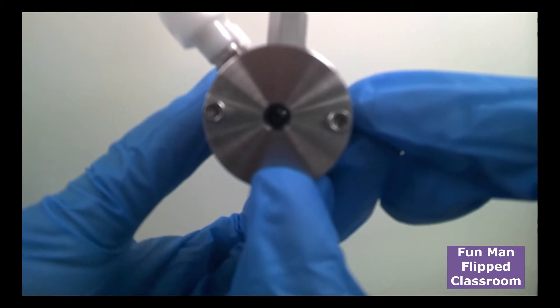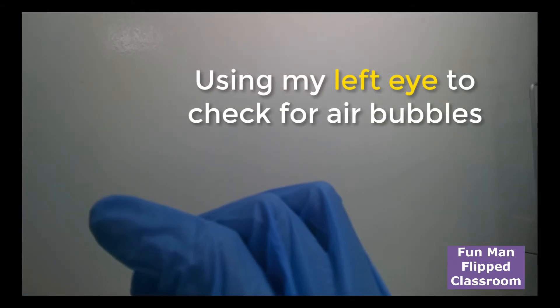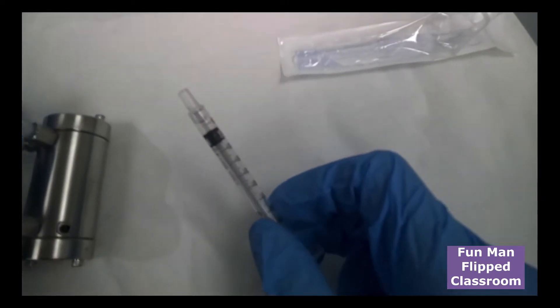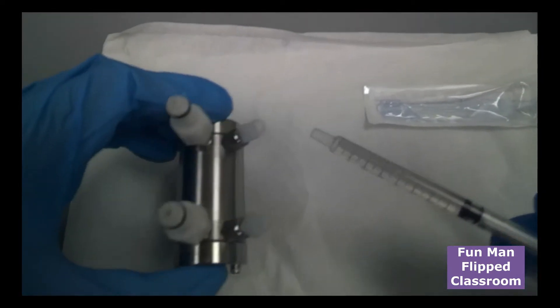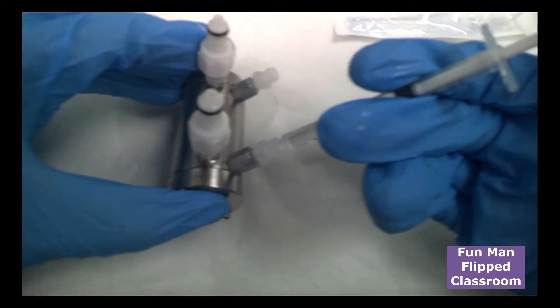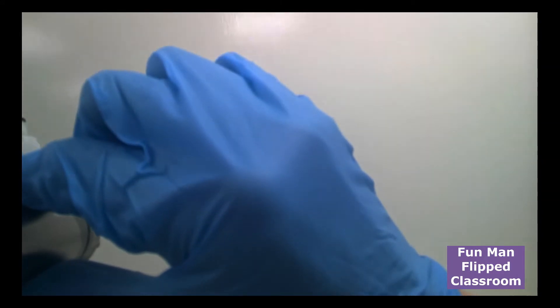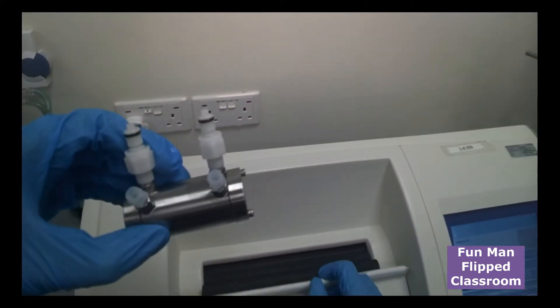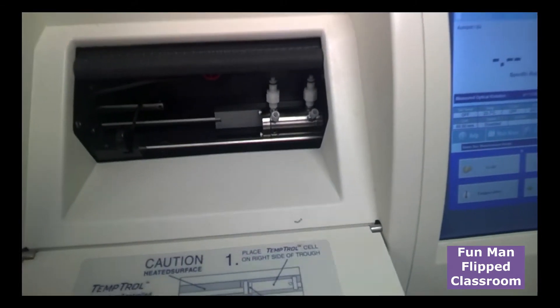If there is, it's not going to be good because the light ray that you scan through can be refracted. So up, down. This gives me just my left eye to check. There were some bubbles here. So what I need to do is, you see, how could it happen? It happened because here, you see, I have some bubbles. So I need to eject out. Take out some. And then make sure there's no bubbles in this syringe. And do that one more time. Push it in from the other side. Good. Now let's do one more check. Now there's no more bubbles.